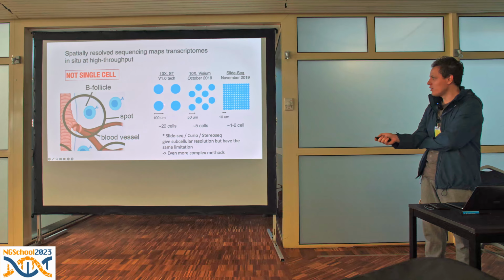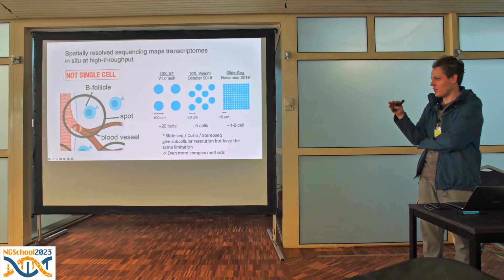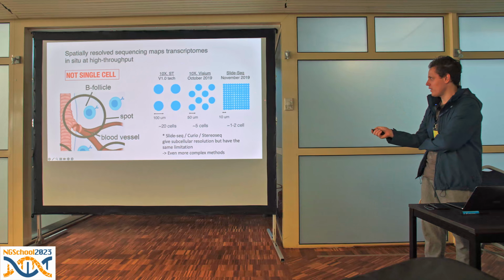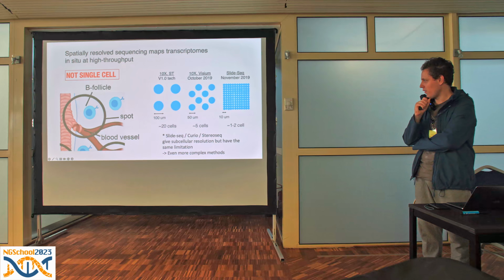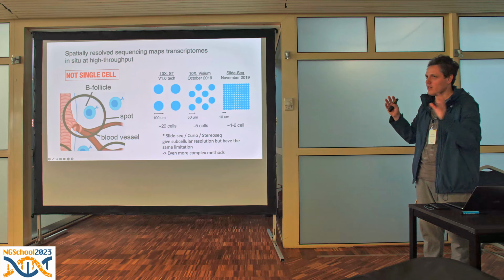Yeah, so the resolution has been improving. It has somewhat reached the theoretical maximum with SlideSeq and StereoSeq methods. However, there are two points to make.